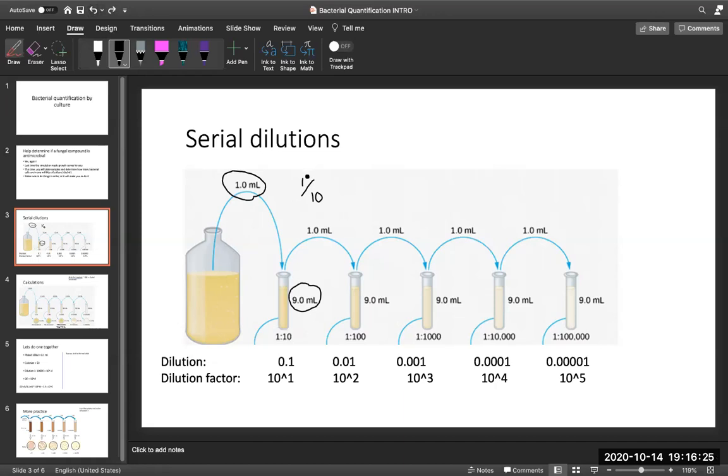And if you were to actually divide this, you get 0.1. So that's the dilution. And when you plate that, the dilution factor that you use will, instead of being 10 to the -1, be the inverse. It's 10 to the 1, because you want to give back the concentration that you took away with your dilution.